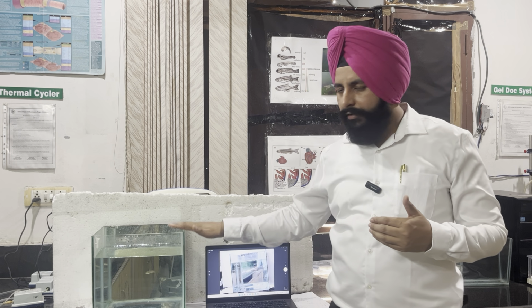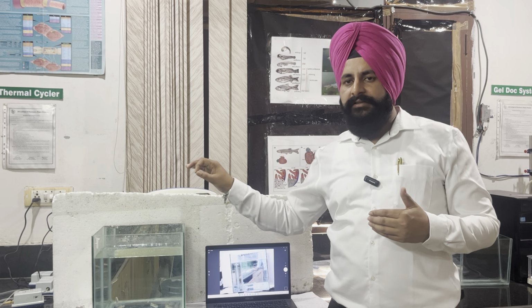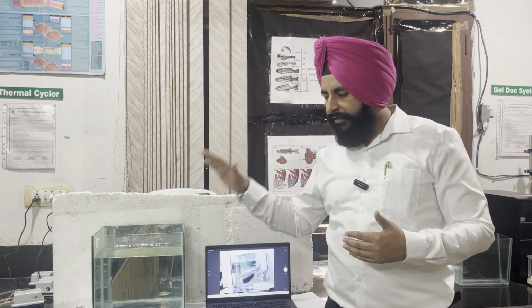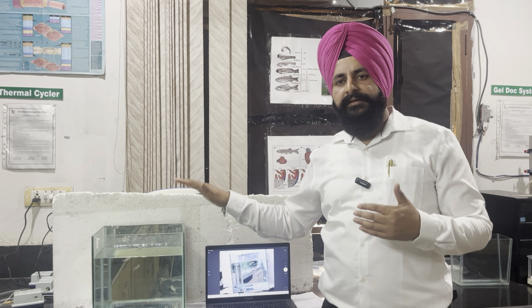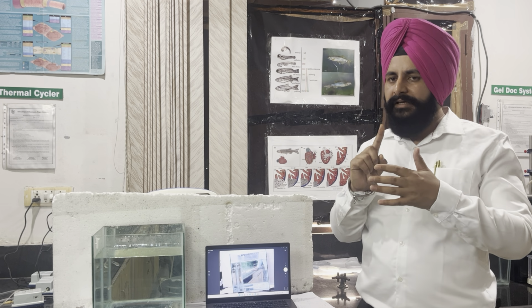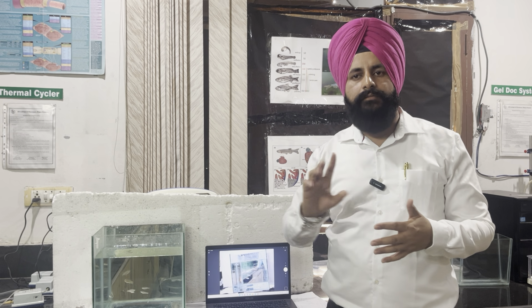Now if you want to induce this model, you will put the fish here for at least 7 days. You can do 4 days or 7 days, daily for 5 minutes, and afterward you will calculate the parameters. In case of chronic, you will place the zebrafish for 14 days, daily for 5 minutes.